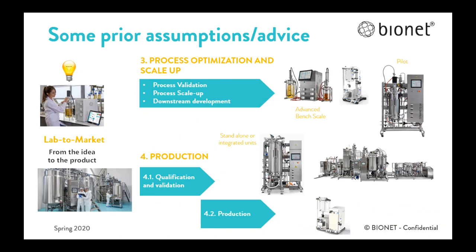Pilot scale means an experimental system that represents the part it corresponds to in an industrial unit. A pilot plant allows investigation of a product and process on an intermediate scale before large amounts of money are committed to full-scale production. It's not possible to design a large, complex product processing plant from lab data alone with any degree of success. Producing small quantities of product for sensory, chemical, microbiological evaluations, limited market testing, or furnishing samples to potential customers.